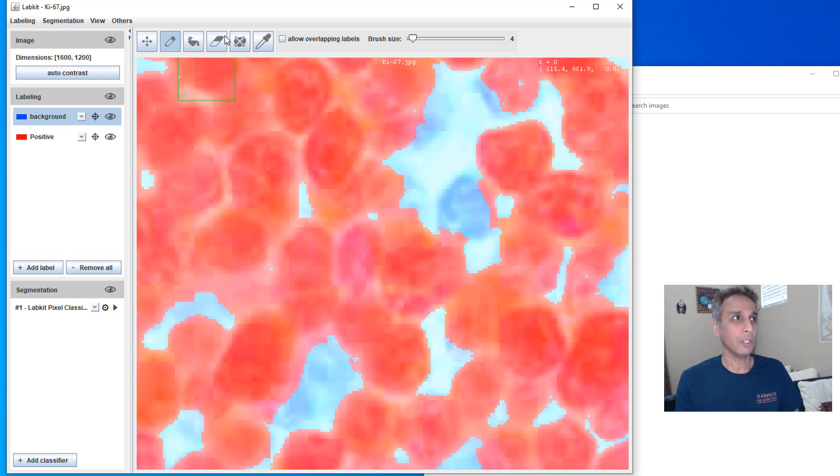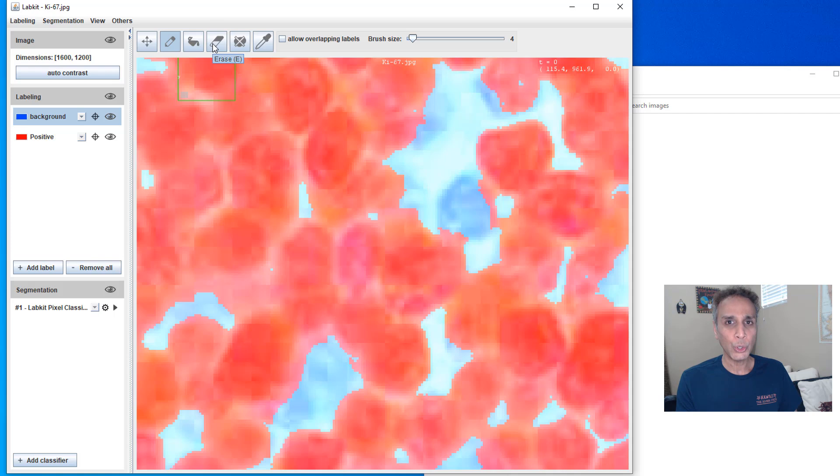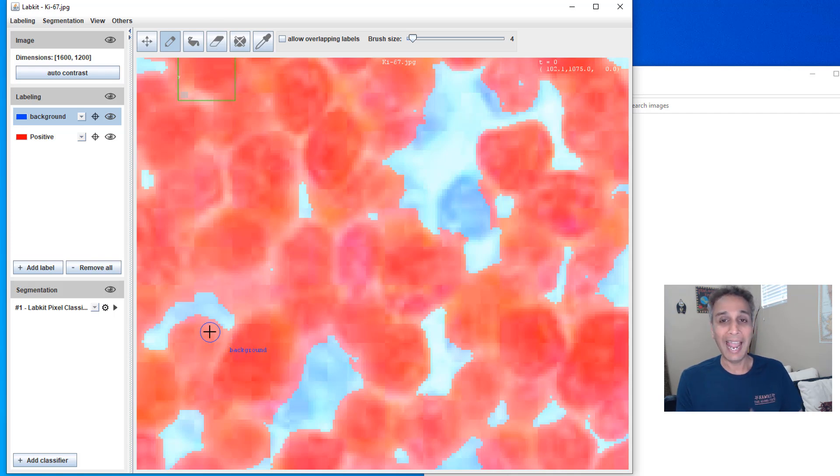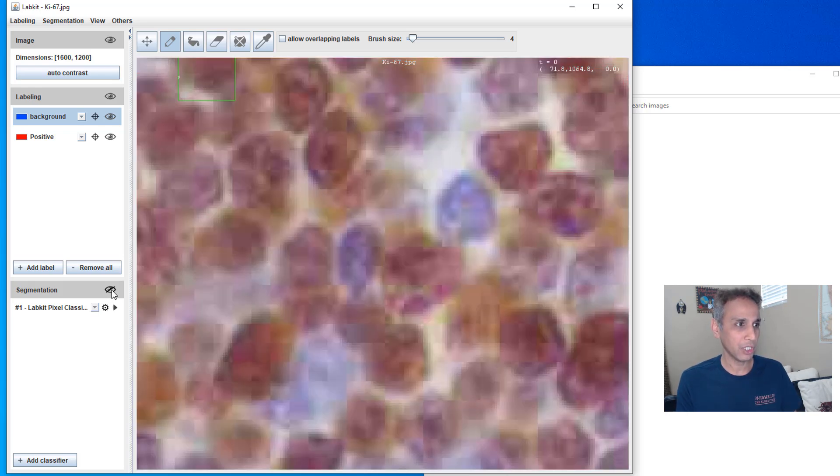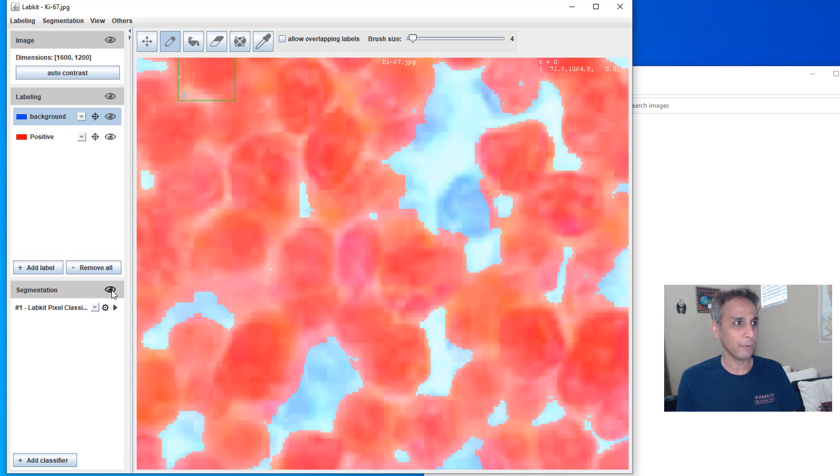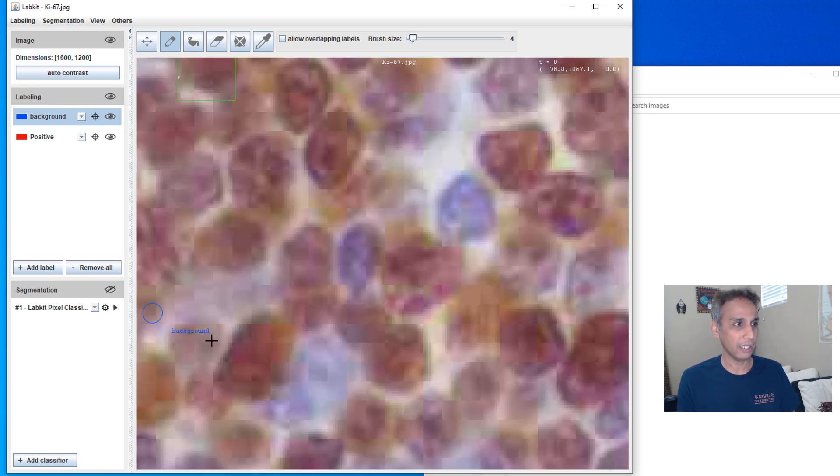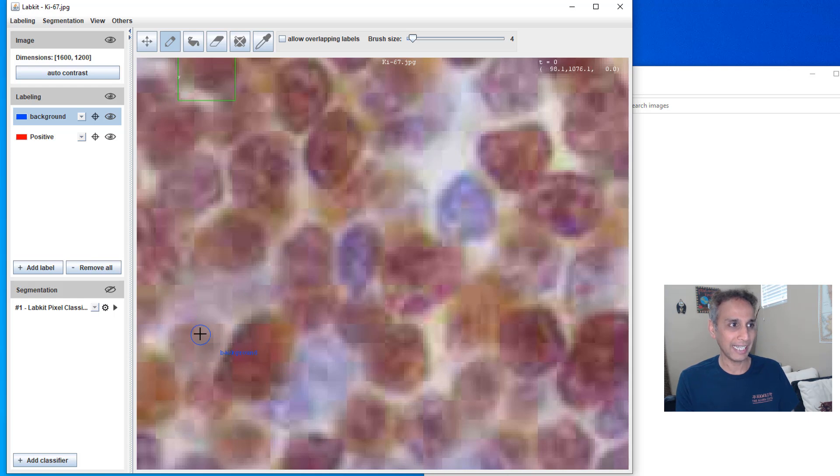One thing, you can go ahead and erase your labels, but I am going to add more labels and train it in an iterative way. So let me turn this segmentation off. You see how it's actually thinking all of these medium gray as, or medium brown as my positive.